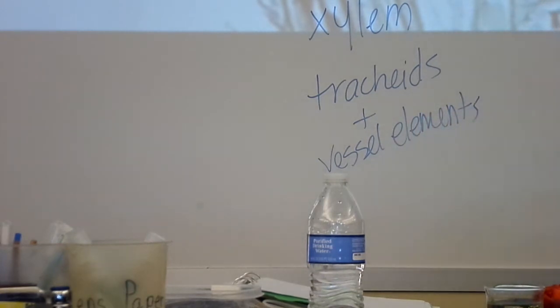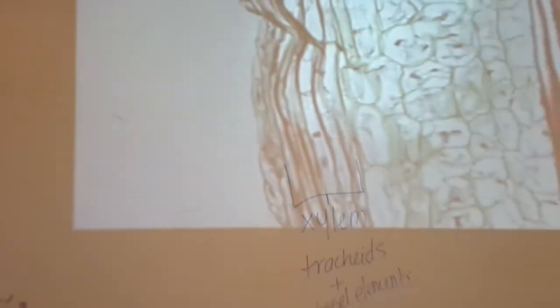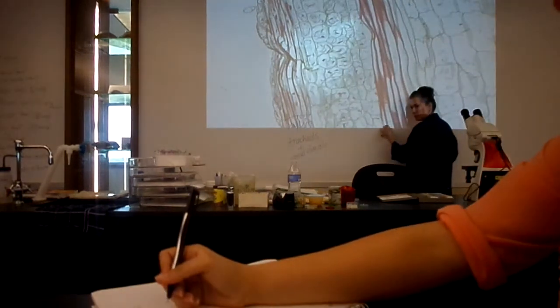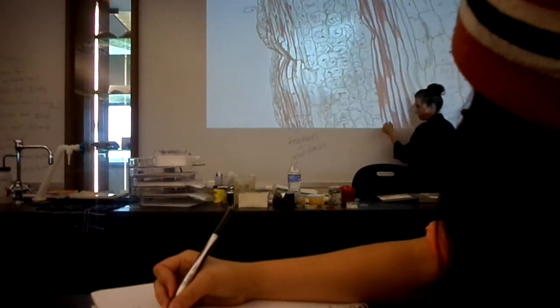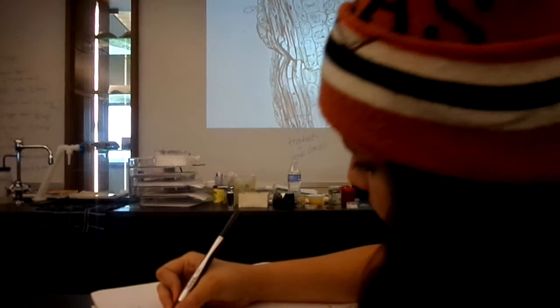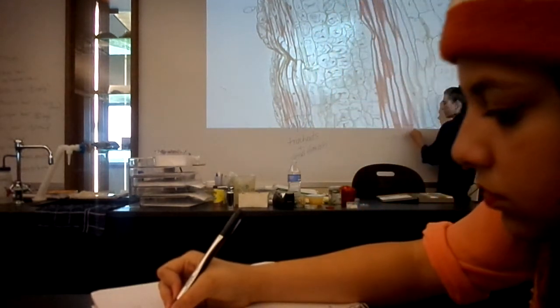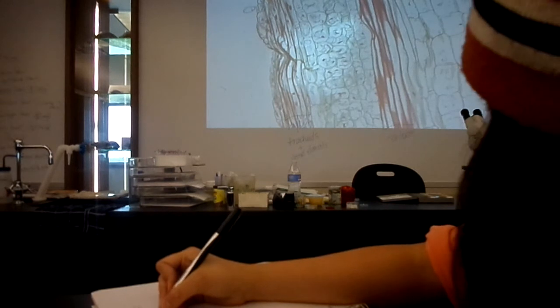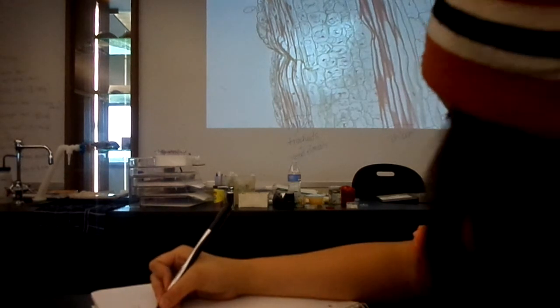Are those both xylem? Nope. Outside xylem. Inside tissue here, this is phloem. Phloem conducts sugars and the products of photosynthesis from the leaves to all other plant parts.